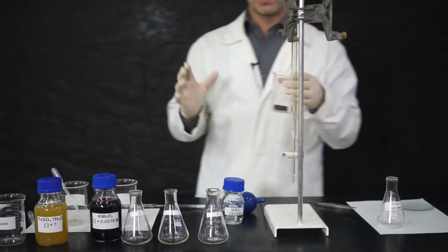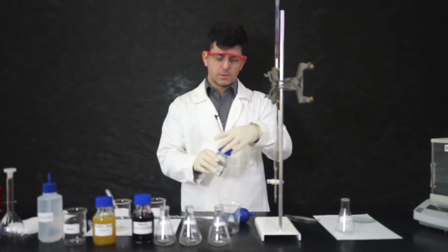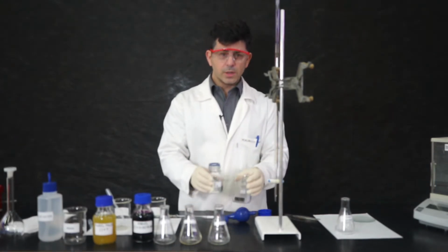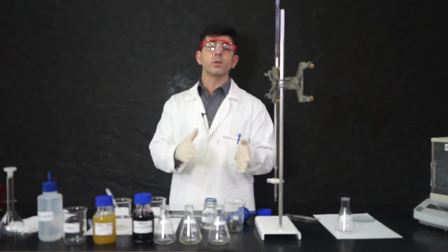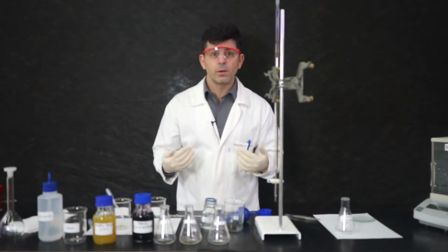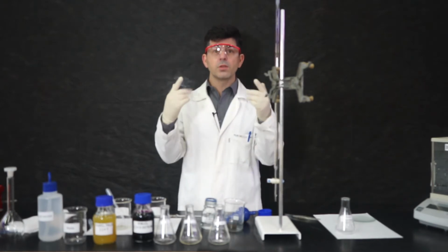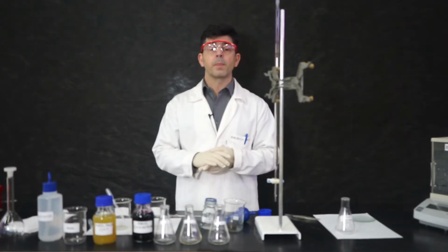Okay, now guys, we will get this piece of ore and we will dissolve it using sulfuric acid, because I need to make sure all this iron is aqueous. Before I do this, working with acids is always something dangerous. So whenever you go to a lab, you need to be wearing a lab coat made of cotton, which doesn't catch on fire very easily. You should wear gloves and goggles. Never go to a lab without all the safety materials you need.